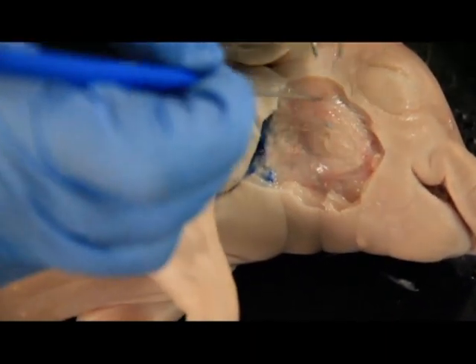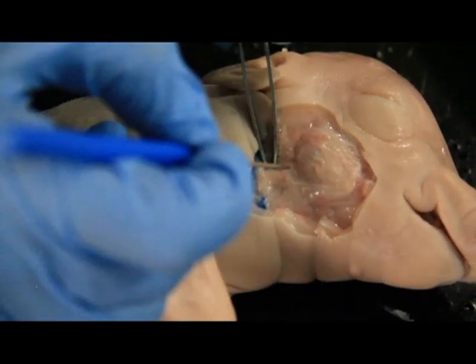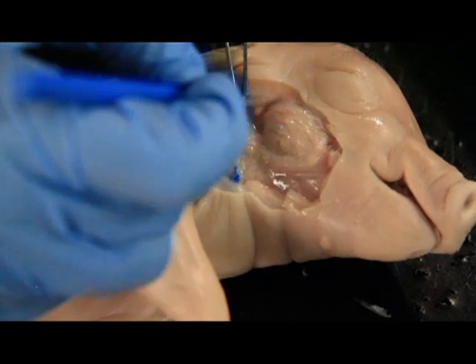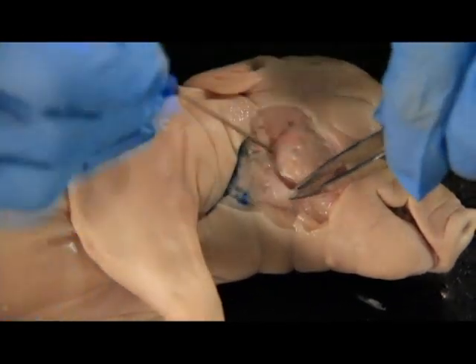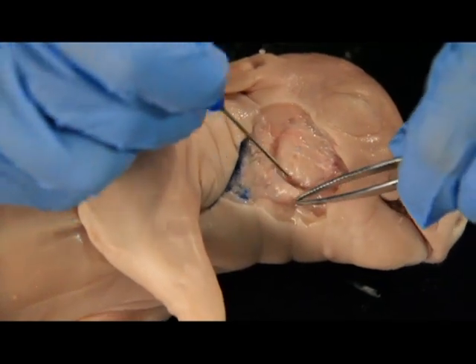So the next thing you want to do is you want to start working your way through this tissue. And this is where that scrape really comes in handy. So you can kind of scrape away without actually cutting or damaging too much. See, we're going to keep scraping away.